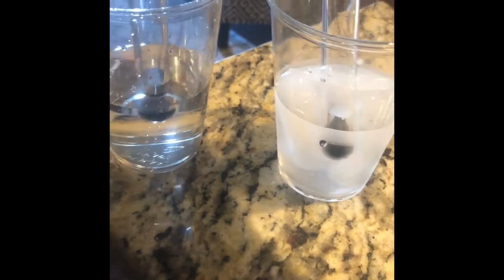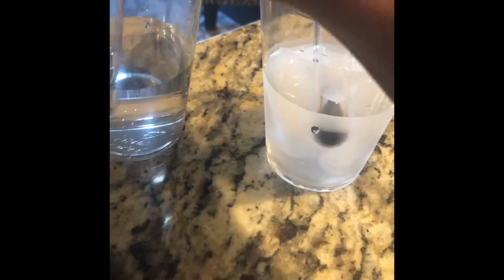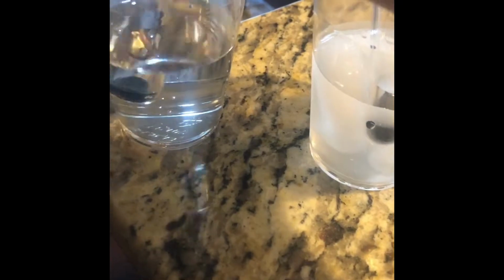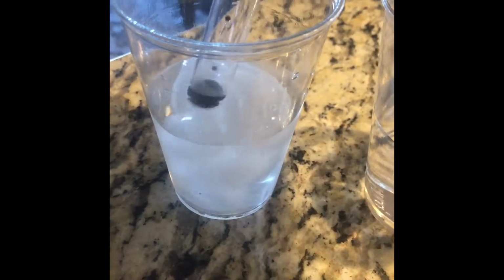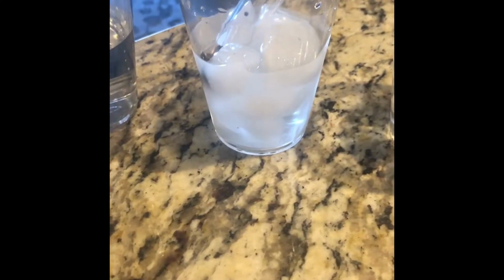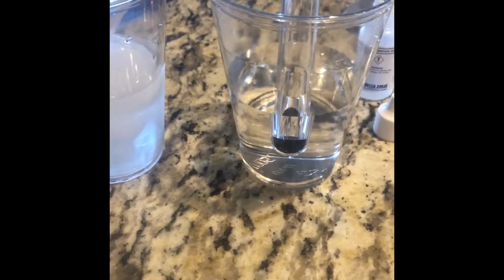What we've done was we put the KI, the HCl, the starch, and the sodium thiosulfate into one test tube, and then we placed a second test tube with the H2O2 within the water to acclimate it to the water, and then of course poured it in here, and then recorded the time it took in each bath to turn this color. Obviously, we're looking at reaction rates and temperature, so it took much longer for the ice bath to convert the color. The reaction rate with the warm water was much quicker, and room temperature obviously fell in the middle.